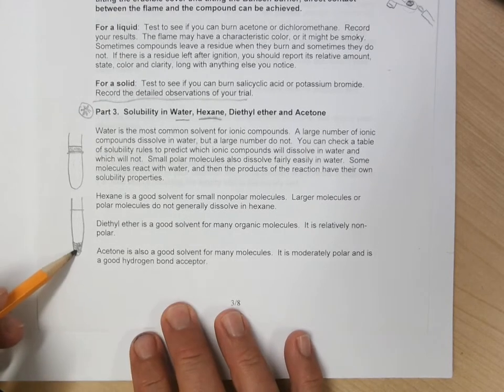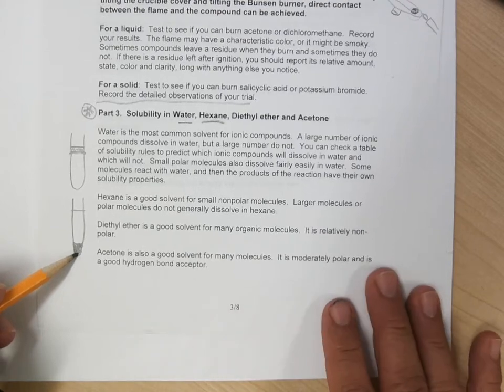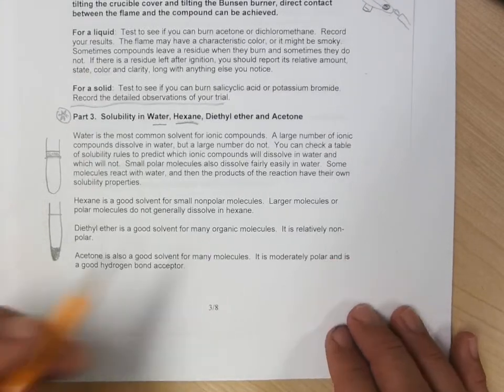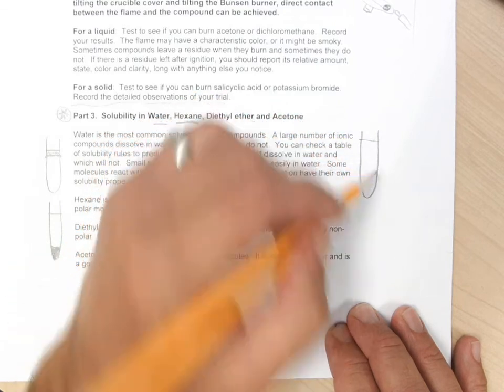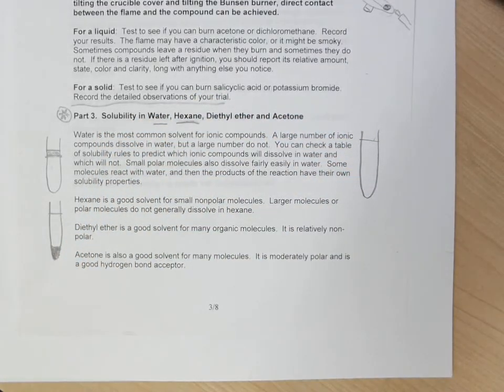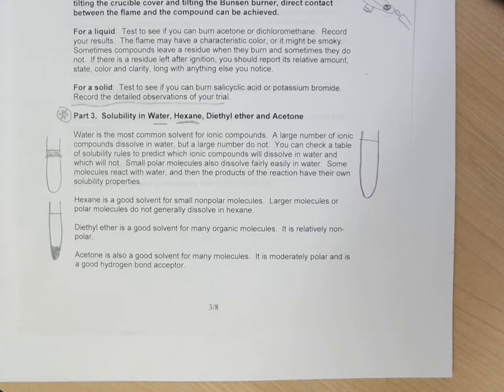And so you can see here that if this was your situation, the new liquid that you add in does not dissolve, it just sinks to the bottom. You get clear phase separation between the two liquids: not soluble and more dense than the solvent. If something dissolves, then you won't be able to see the separation at all, because the molecules will have all dispersed themselves really well, and so that's when you'll have something that's soluble.